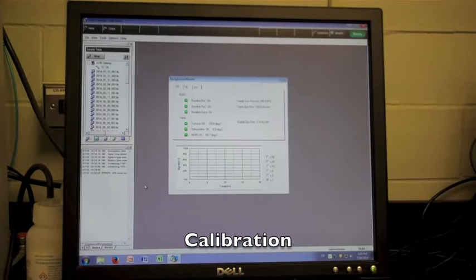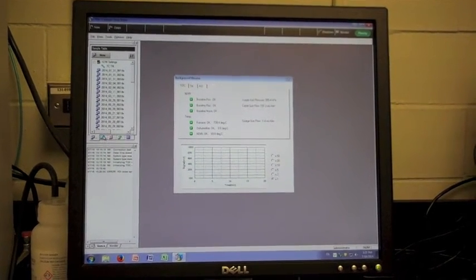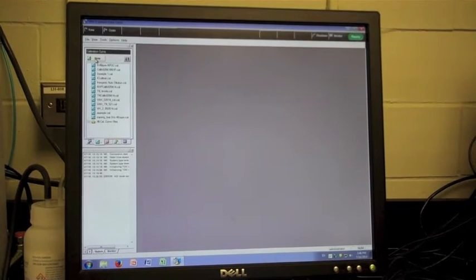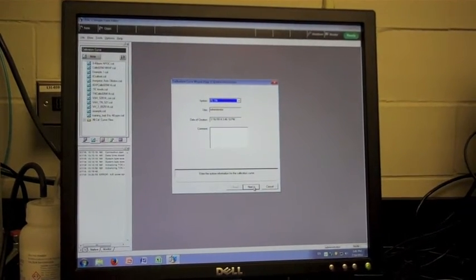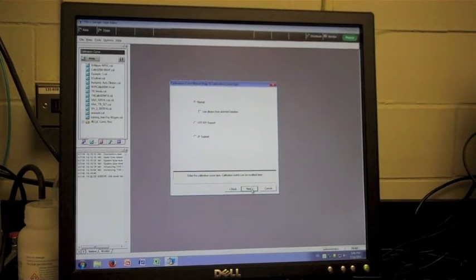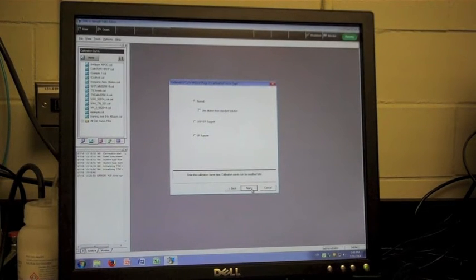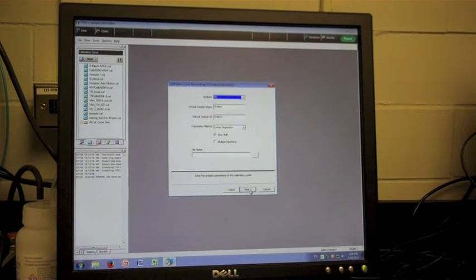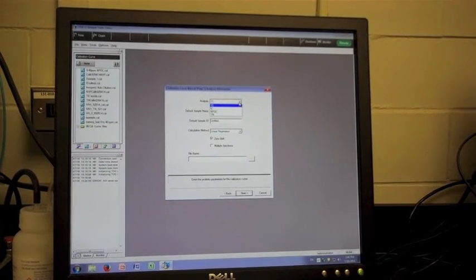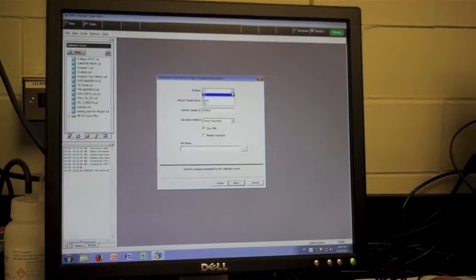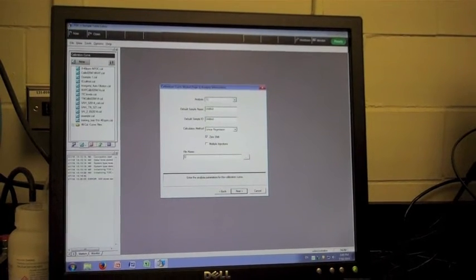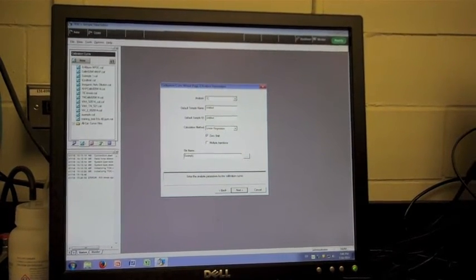In order to perform a calibration, select the calibration option from the left side of the window, then select new. Once selecting new, press next on the first window presented. To perform a calibration from multiple standards of different concentrations, select the normal option and continue. Next, select the type of test associated with your calibration: total carbon, total organic carbon, total inorganic carbon, or total nitrogen. In this window, you will also give a file name to the calibration you are performing.